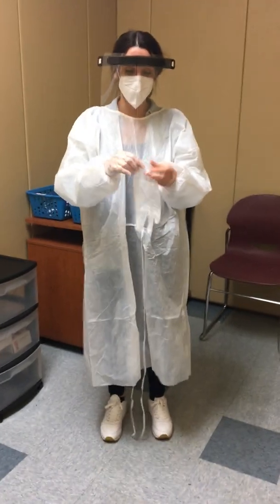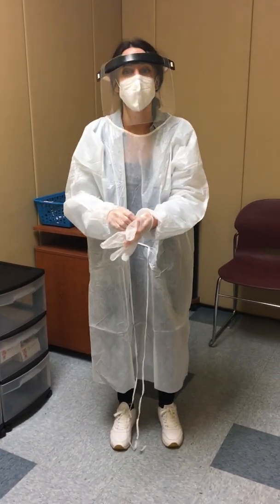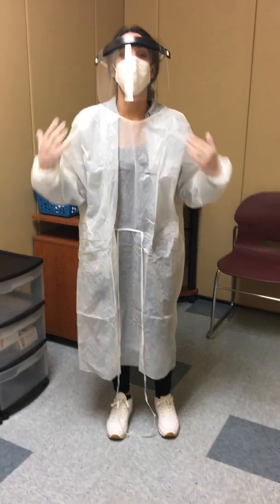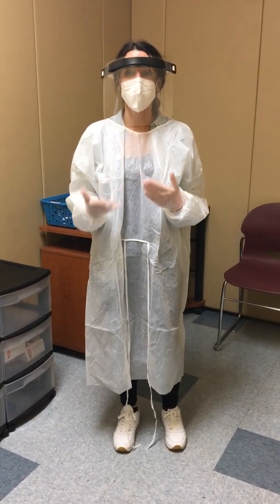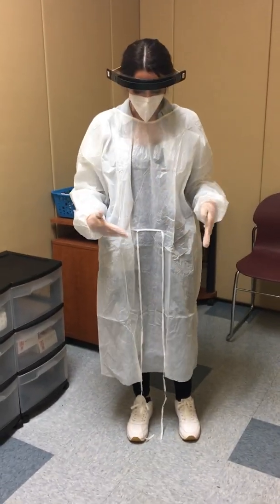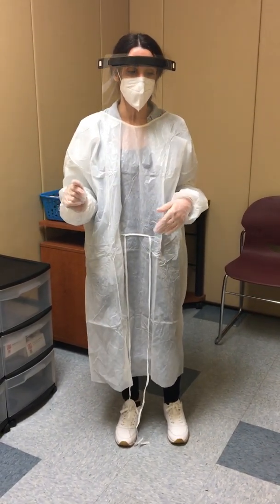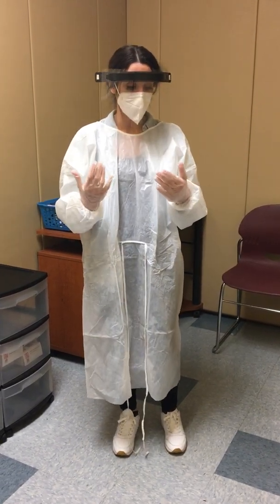And if for some reason I was removing my gown and I wasn't able to get the ties off, they were stuck, it ripped, something like that, then at that point, just take it off and dispose of it. The last thing that we would want would be for you to get contaminated when trying to remove it. So if you weren't able to remove it that way, just remove it and throw it away and get a new gown.